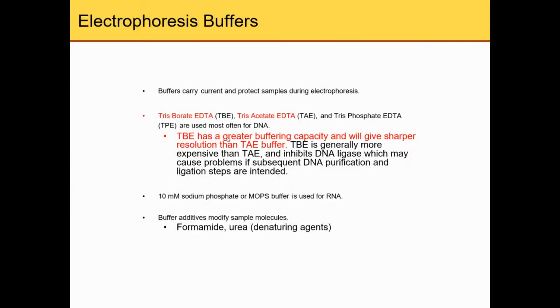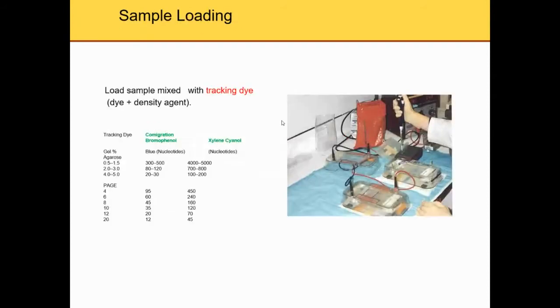And then to run the DNA, you need to have a buffer. So the buffer, like for example, TBE or TAE, the Tris borate EDTA or Tris acetate EDTA, and then they can buffer the electrophoresis so that the pH will not change, and to maintain a certain pH so that you can have a stable DNA electrophoresis, the migration.